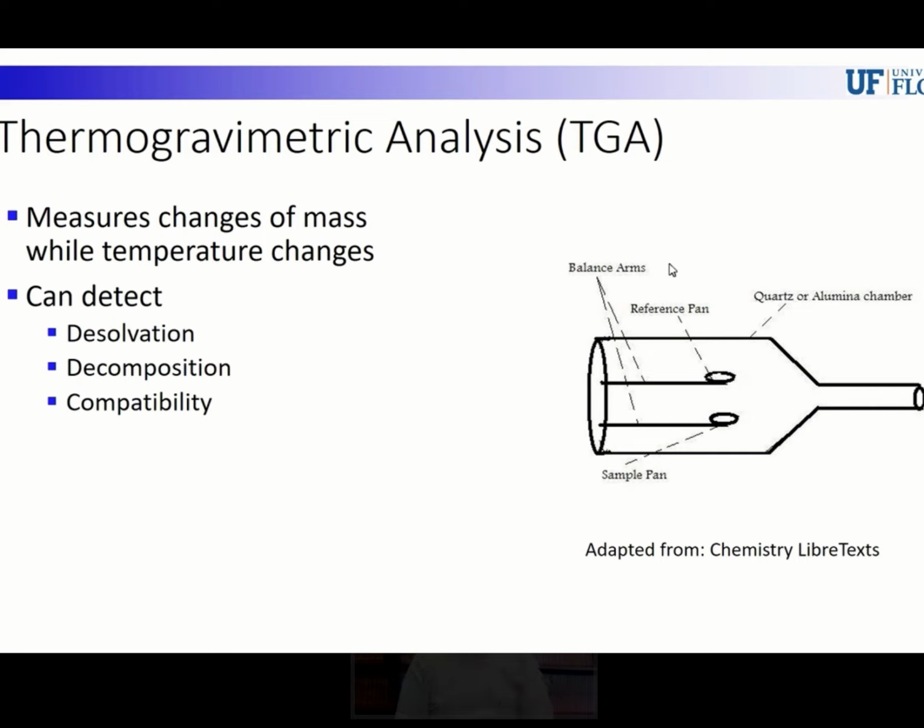It is possible for the mass to go up, okay? Think of a situation where something reacts with oxygen. Something likes to burn at a high temperature. And so if it reacts with oxygen at a high temperature, you're going to take the mass that you started with, add some oxygen from the atmosphere, and your mass will go up.